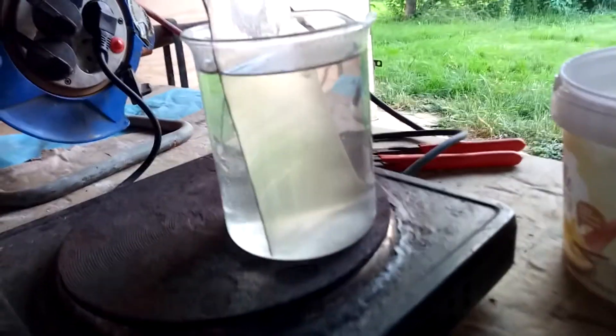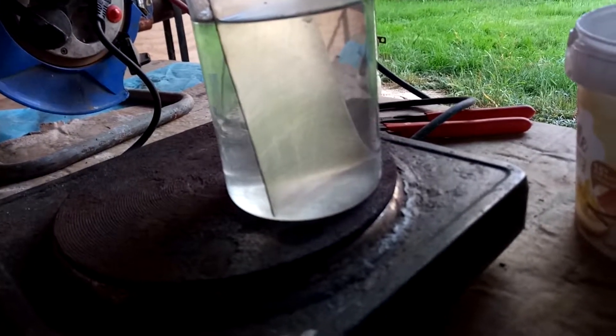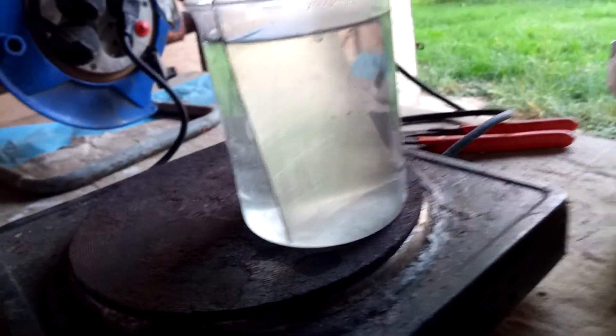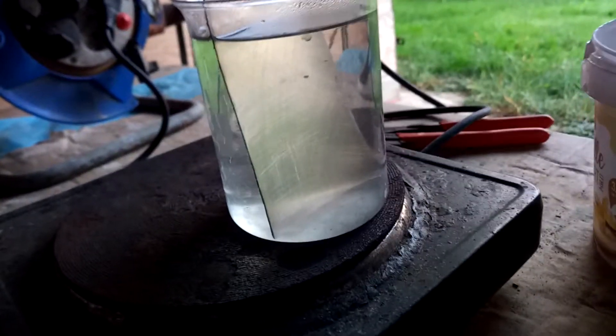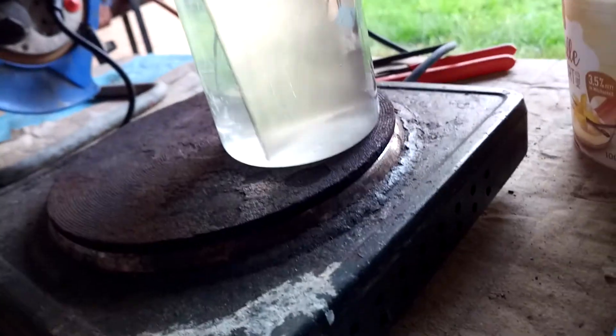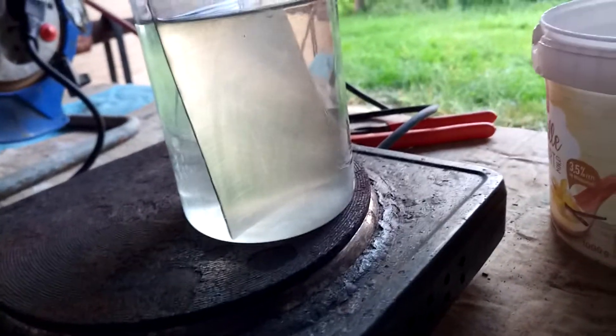Hey everyone, this is just a little low-effort video because I figured out something cool and I thought I'd share. A while ago I showed how I made manganese dioxide on titanium electrodes, and from that I etched titanium using oxalic acid, which I also have in this solution here. Now I'm repeating this, and last time when I did this, the titanium quickly started to bubble, the solution turned yellow, and the titanium was etched pretty well.